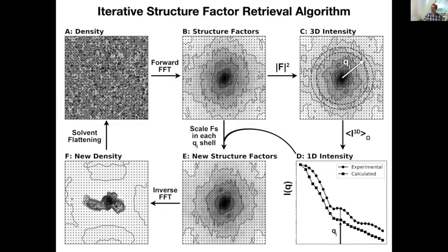So what we do is we start in the upper left with completely random density. So we're showing a grid here, right? A grid of points. And this grid of points is how you tell a computer what electron density is. It's like a three-dimensional image, right? And so there's pixels, right? Just three-dimensional pixels that we call voxels. And each one of these pixels or grid points has a value or a density associated with it. And then your viewers like Chimera or PyMOL are actually just viewing that in this fancy interpolated graphical program. But ultimately what it is is just this grid of points.